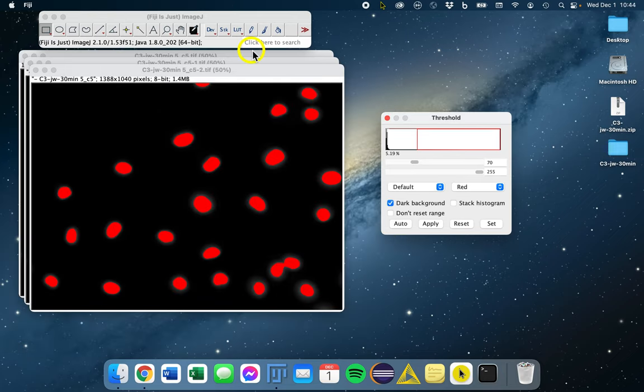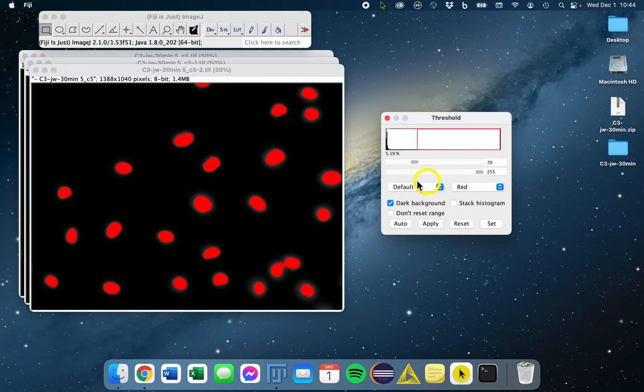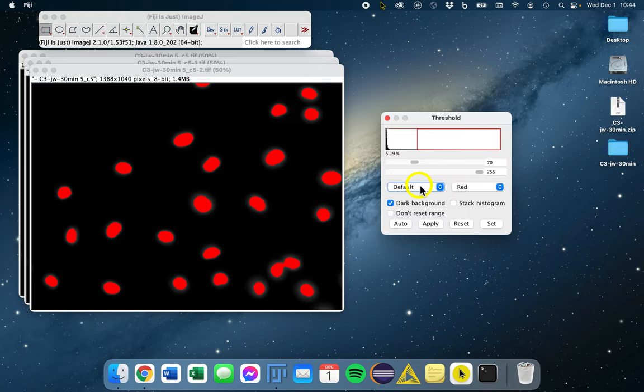Now in general, OTSU is a great one to choose for nuclei, and the default method is based on OTSU. Going back to why we're using auto threshold methods, we want to use that when possible because it's most reproducible.